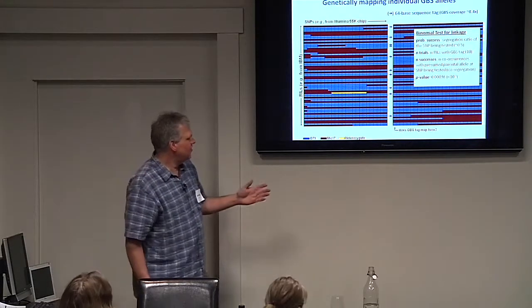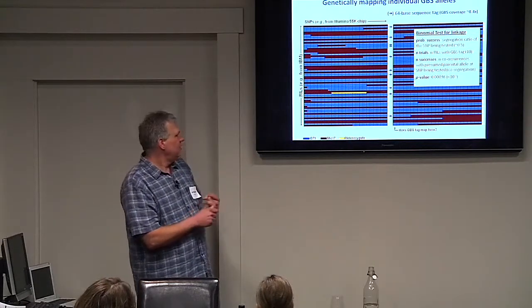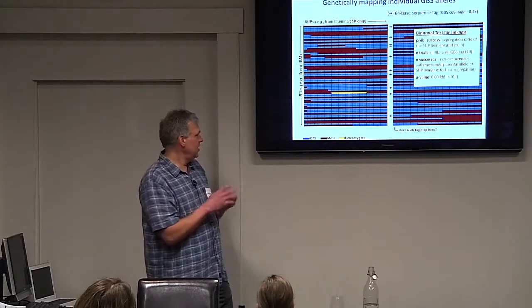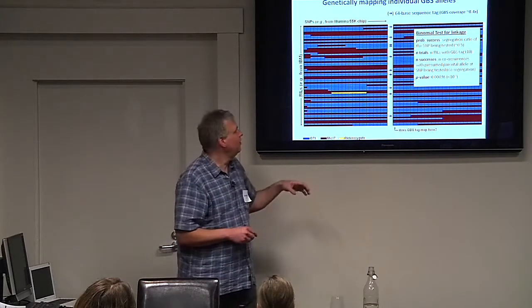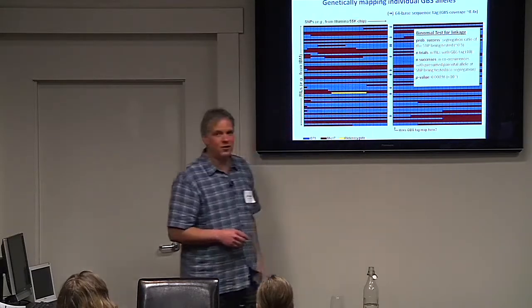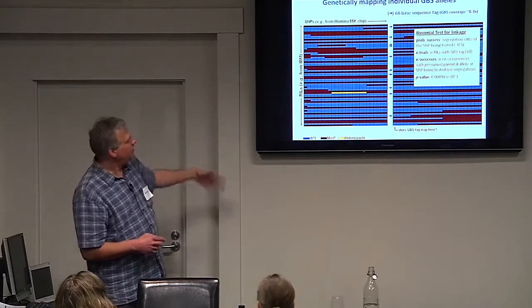The beauty of this is we totally ignore the absence of the tag, which could be a Mo17 tag or it could be missing data, and we don't know. So we just use the presence of the tag. Our sample size is 10 here, how many times we observed the tag in the RILs. To get that, we of course did GBS on all the RILs.